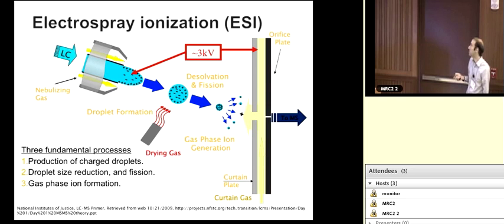And then for a GC, the components are much the same. You've got your chromatograph going on essentially in a capillary tube inside an oven. Your ionization happens inside an ion source of the mass spectrometer. Your mass analyzer is in there too, and then you've got a data collector connected to a computer. Okay, so that's it for chromatography until Steffi's talk. But let's talk about mass spec.